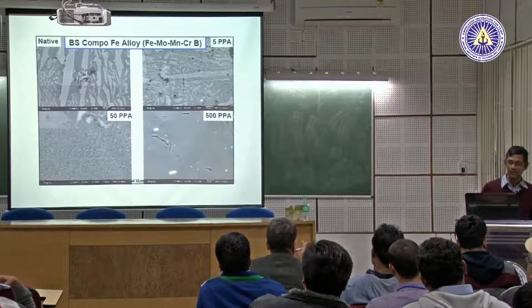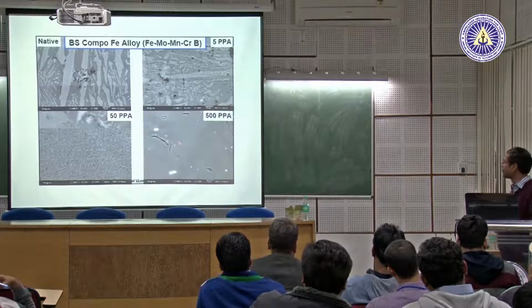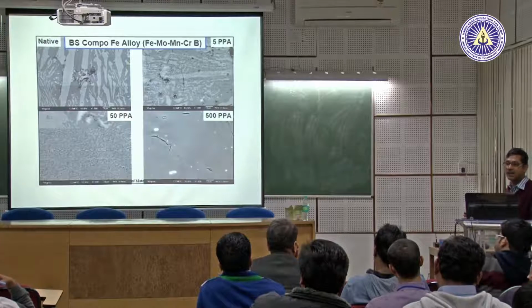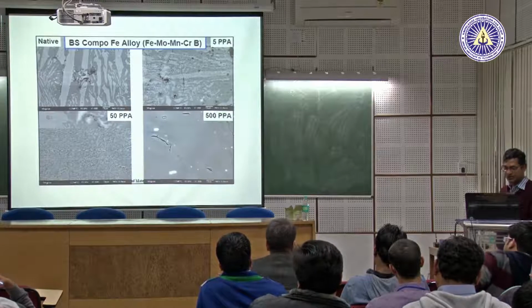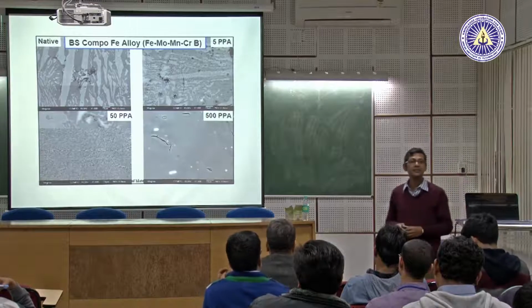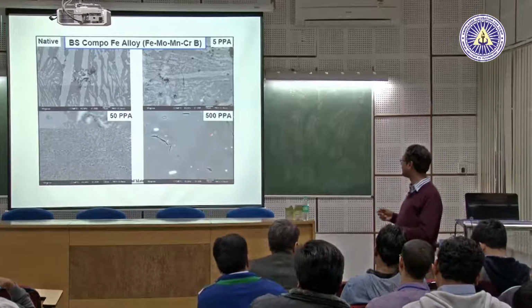Paint will not allow you to see what is inside. You will not get to see exactly the sample surface. Coating material structures will also come there? Yeah, that's what I am giving. This example is that. Coating material structure will come. Here this is the situation.